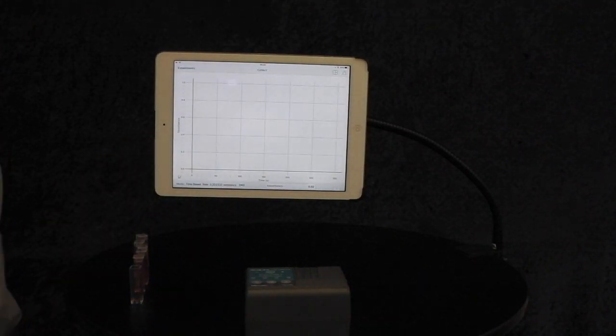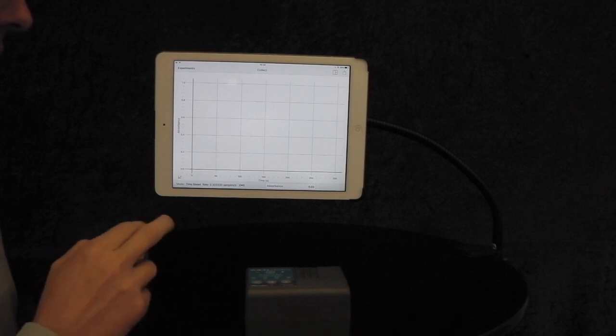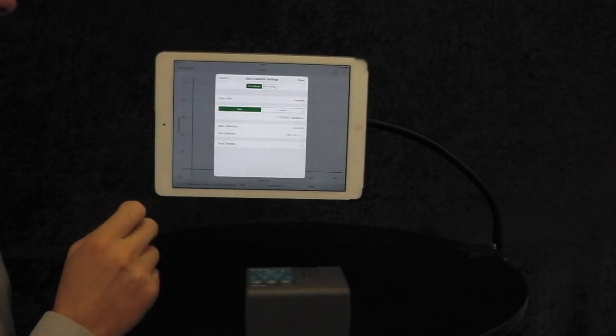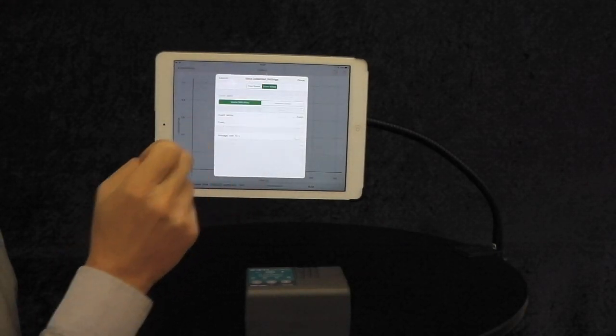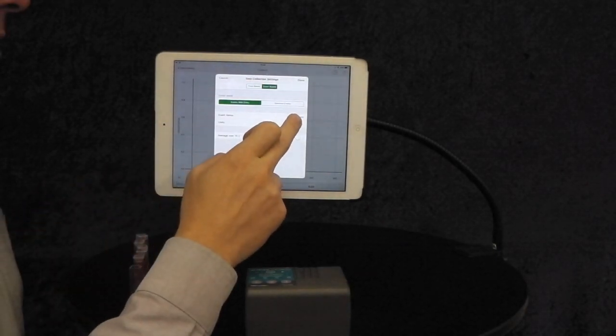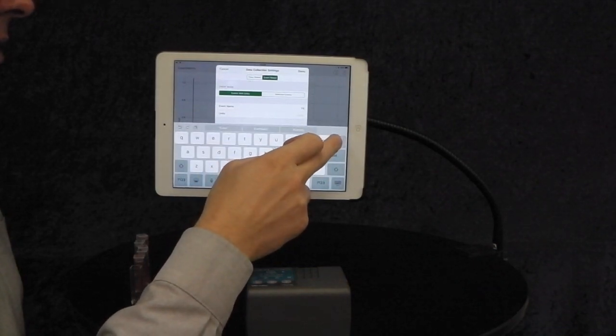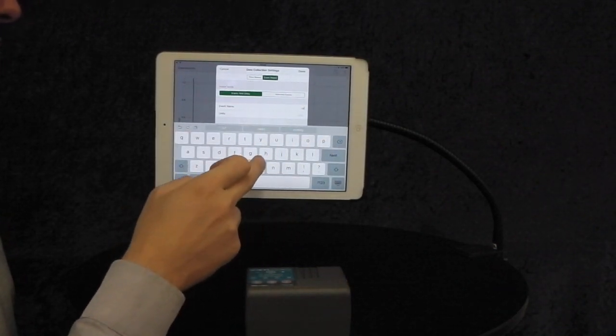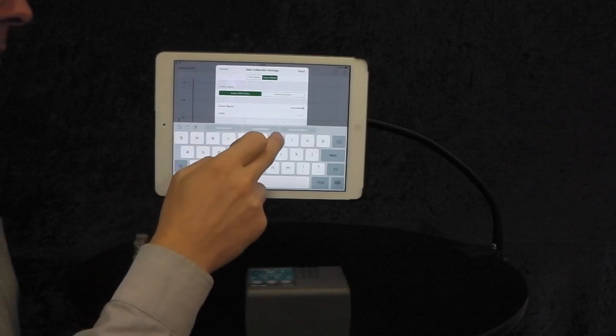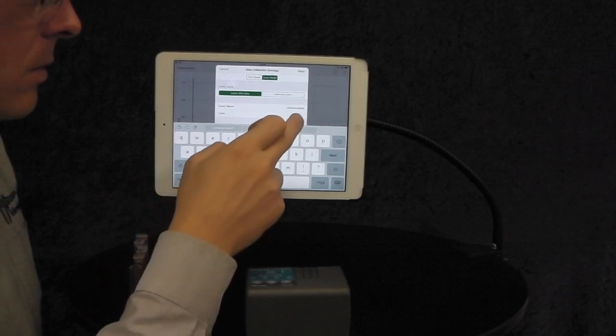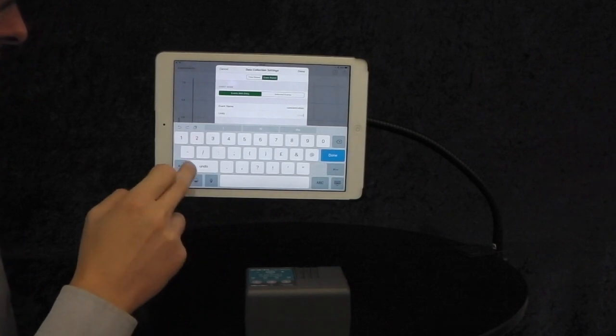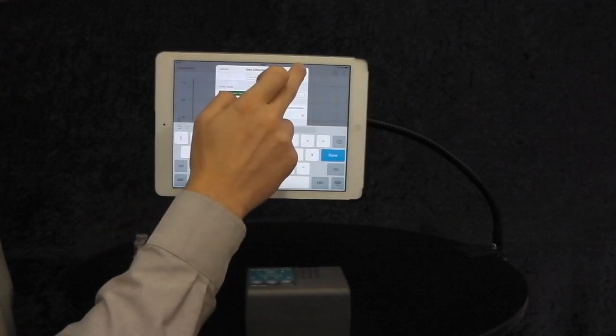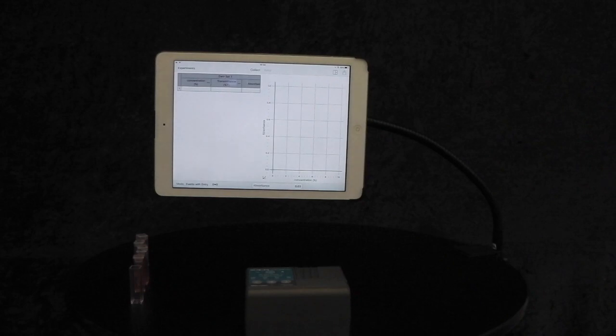We first need to change the settings of the experiment to an event with entry. Tap Mode in the bottom left hand corner, click Events Based. Give the event a name. In this case, it's Concentration. And the units, I'm using a percentage. This could be moles, this could be any unit that's specific for your experiment.